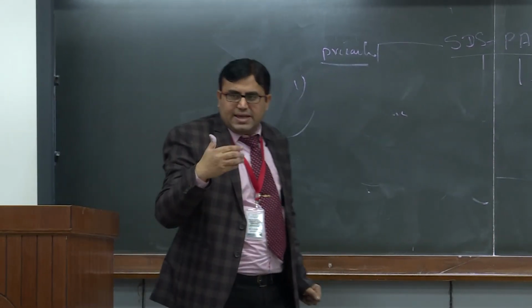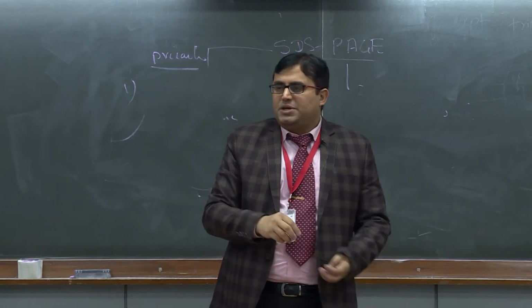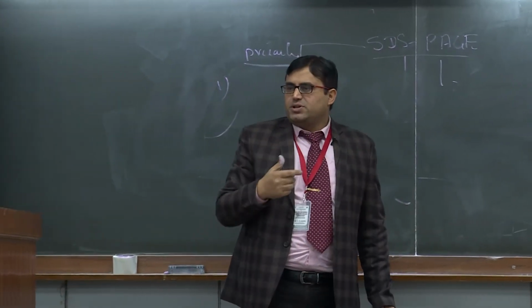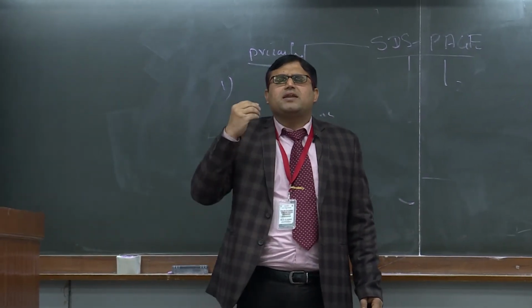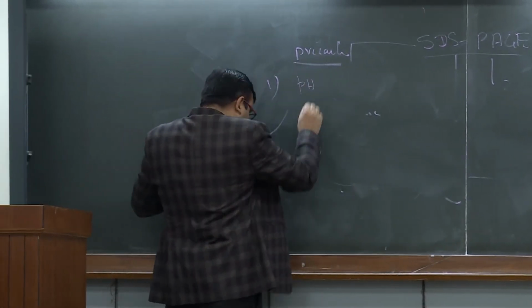First important thing, as I told, is pH. You cannot manipulate the pH. pH should be strict, what has been written over here. So it will have a direct effect on your result. So for pH, you should be extra cautious.